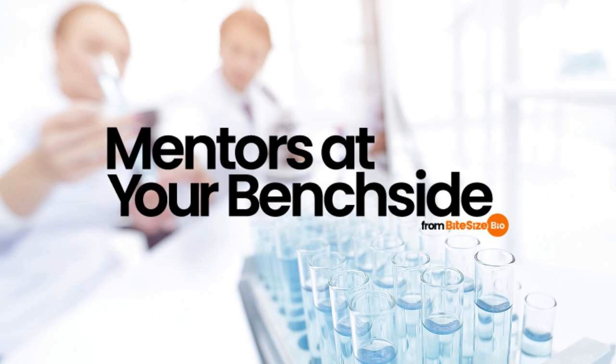If neither method works to remove the debris, buy new stocks. Gently mix your sample and the trypan blue at a 1:1 ratio in a fresh tube and incubate the mixture for 3 to 5 minutes. Then proceed to nuclei counting. For a detailed explanation of testing cell viability, see reference 4 in the corresponding online article.